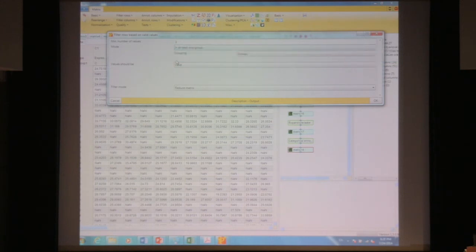So in at least one group is particularly useful for label-free and especially even for phospho data. If you can imagine, if we have treated one of our experiments with some stimulus which has increased the phosphorylation dramatically, then we might find a lot of sites quantified in that condition.